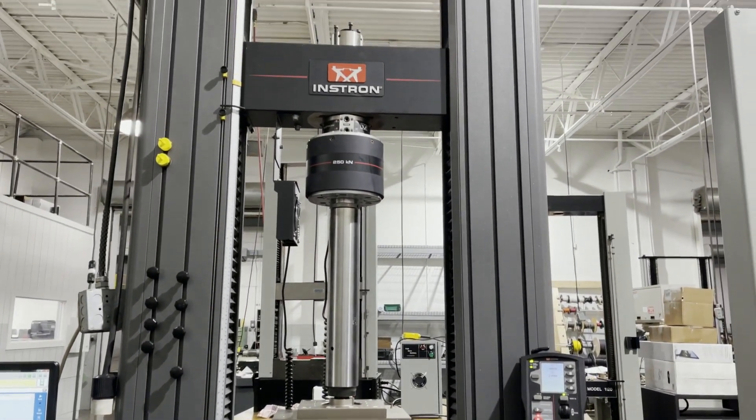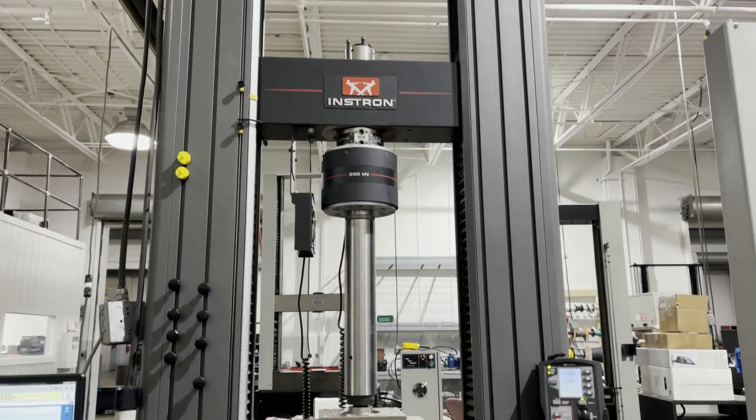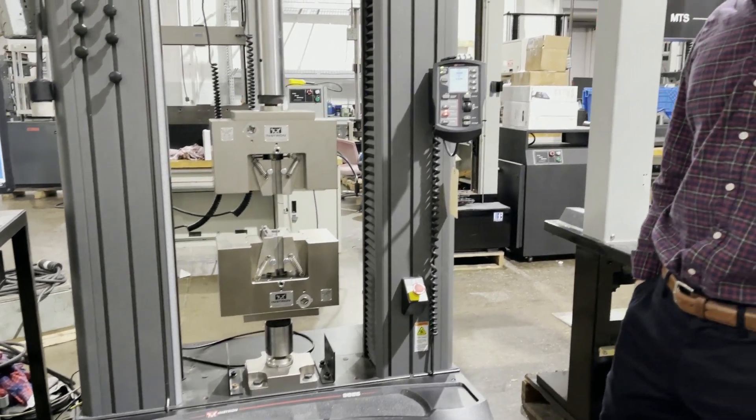The lab was doing composites testing, and they have a lot of nice NADCAP certified accessories for this unit. We'll include some of them with the sale.